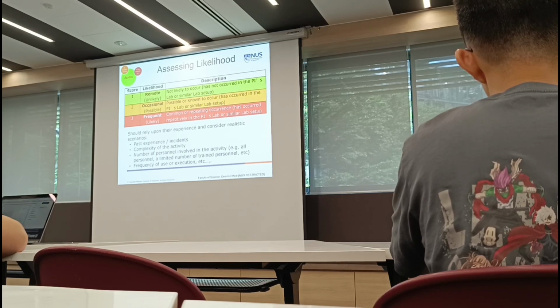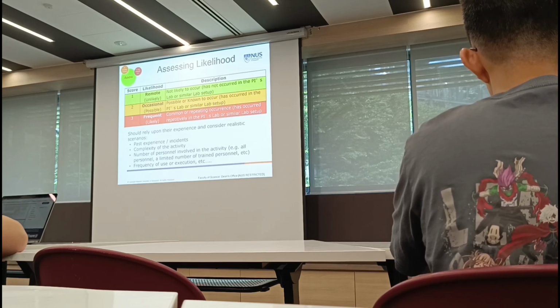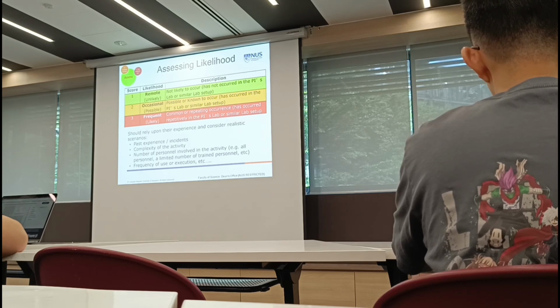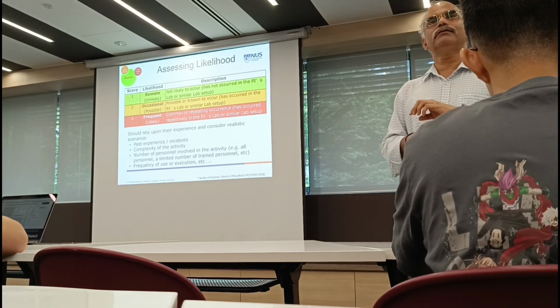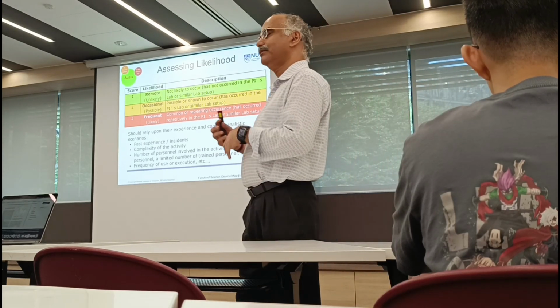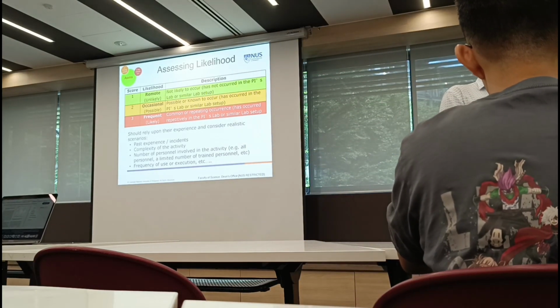So if I'm using very little, like 100 milligram, the severity is still high, it can catch fire if it's 99%, but the likelihood of catching fire is small because I'm using a very small amount, right? Or I'm going to use 60% paraffin coated lithium aluminum hydride, then the likelihood of fire is almost zero. It becomes a remote chance. Occasional or frequent: frequent would be, it is guaranteed it's going to happen. Then that's when you go to elimination, trying not to do that process. But occasional, maybe you can still do it, but with an additional control.